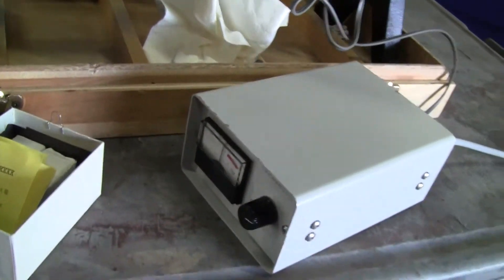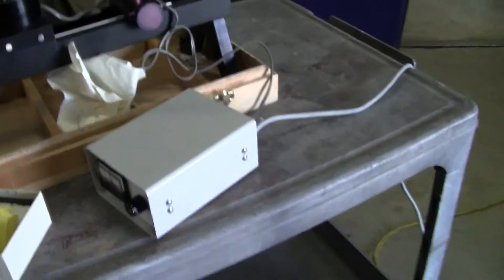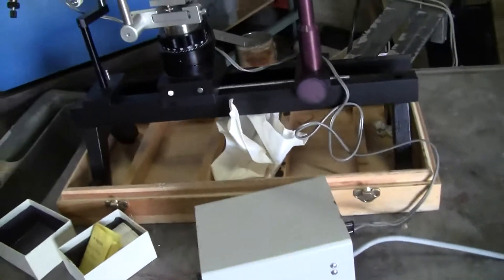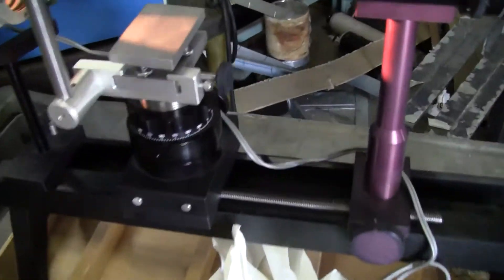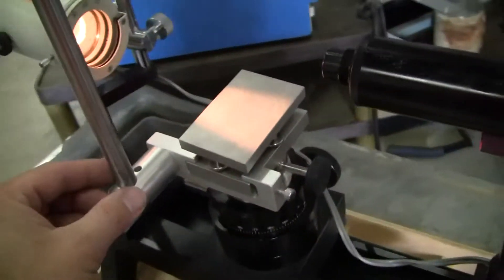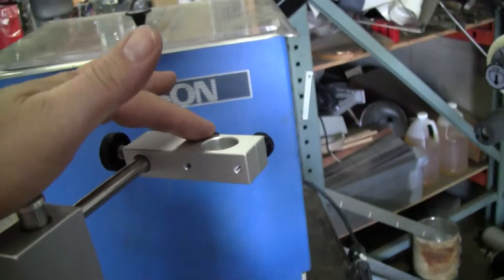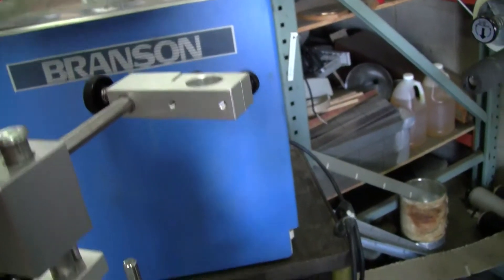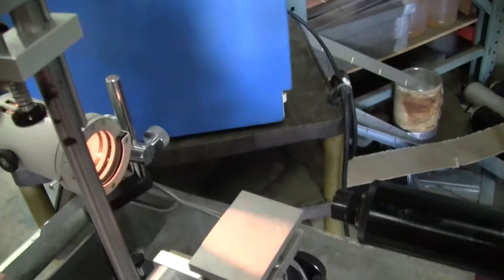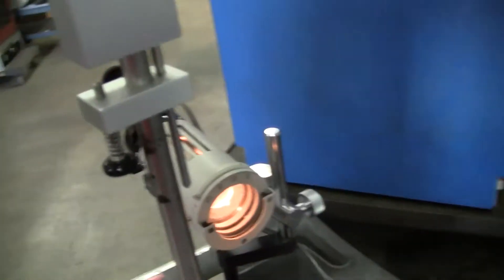Throw that down into a normal range. There is no syringe, but there's a syringe assembly though.